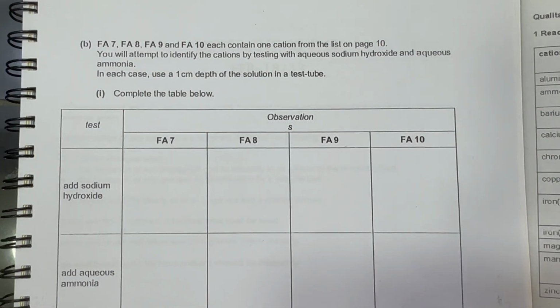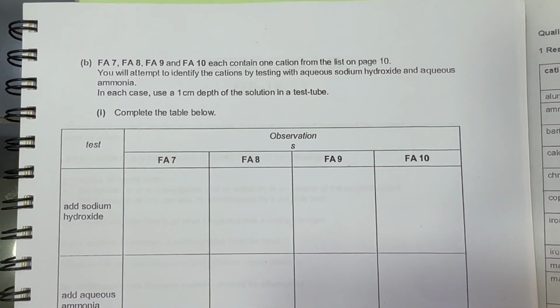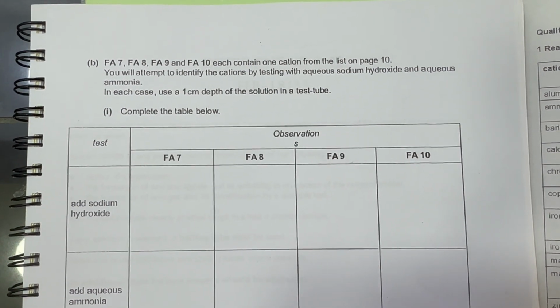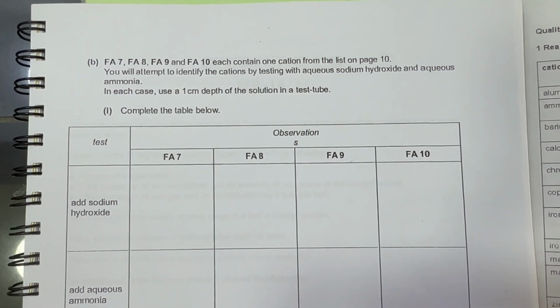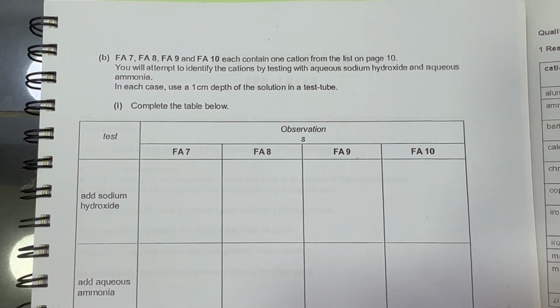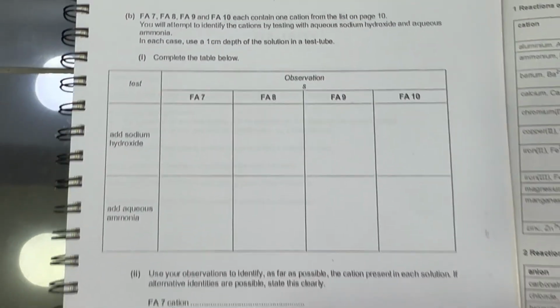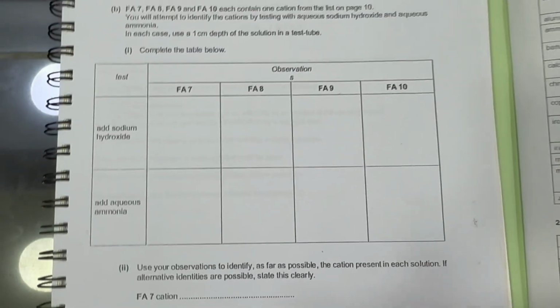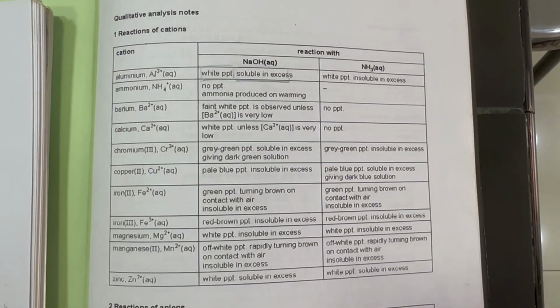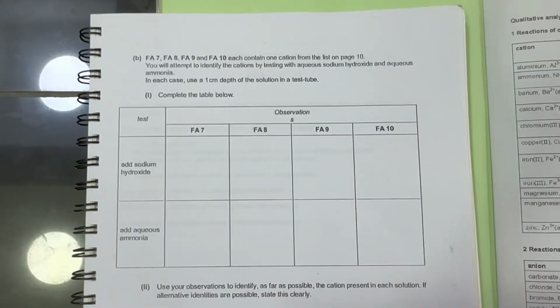Now in this part they say FA7, 8, 9 and 10 each contain one cation from the list on page 10. You will identify the cations by testing with sodium hydroxide and aqueous ammonia and complete this table. In each case, use a 1 centimeter depth of solution in a test tube. Now we can see we have been provided with 4 of these solutions, and we are looking for the cations by using sodium hydroxide and aqueous ammonia. So let's perform these tests one by one now.